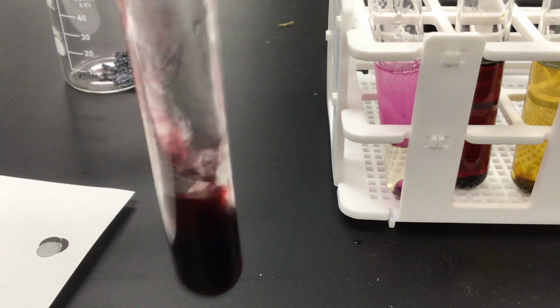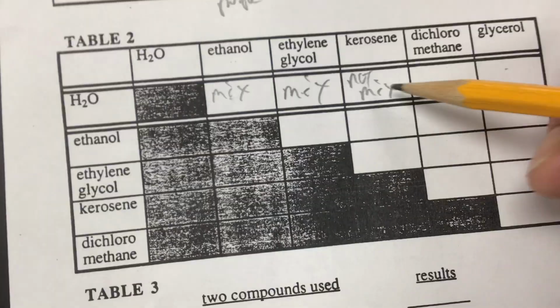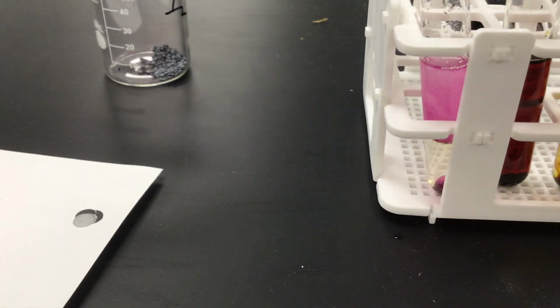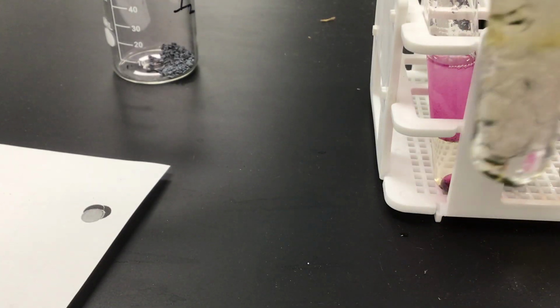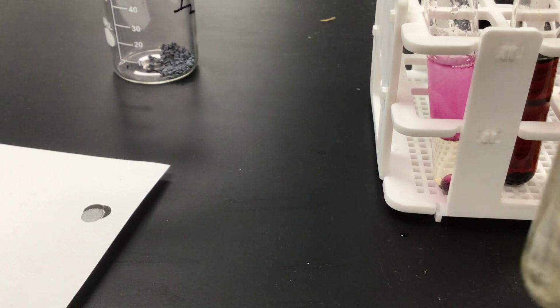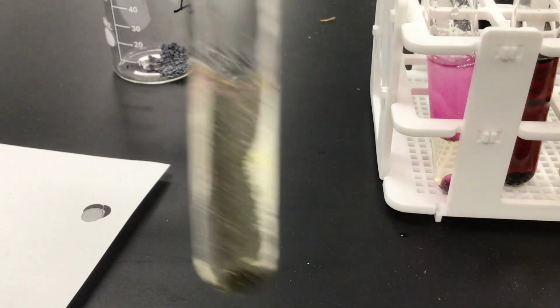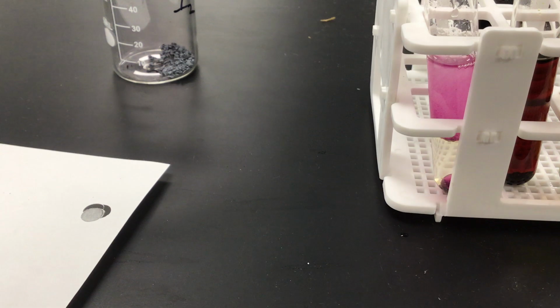This time the dichloromethane is on the bottom. And the last one, glycerol and water. All right, and they did indeed mix.